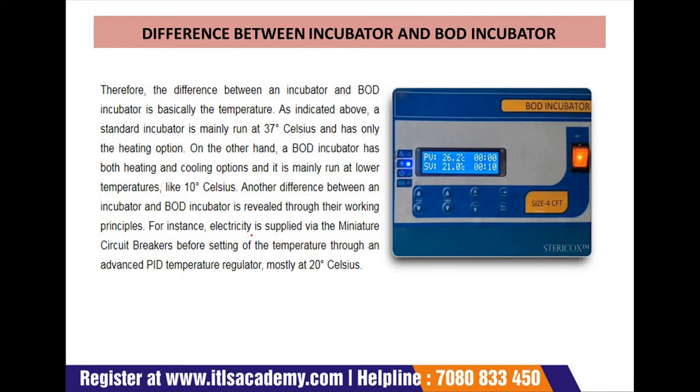Now we will discuss the difference between an incubator and a BOD incubator. The difference is basically the temperature. As indicated above, a standard incubator mainly runs at 37 degrees Celsius and has only heating options. On the other hand, a BOD incubator has both heating and cooling options and mainly runs at lower temperatures like 10 degrees Celsius.